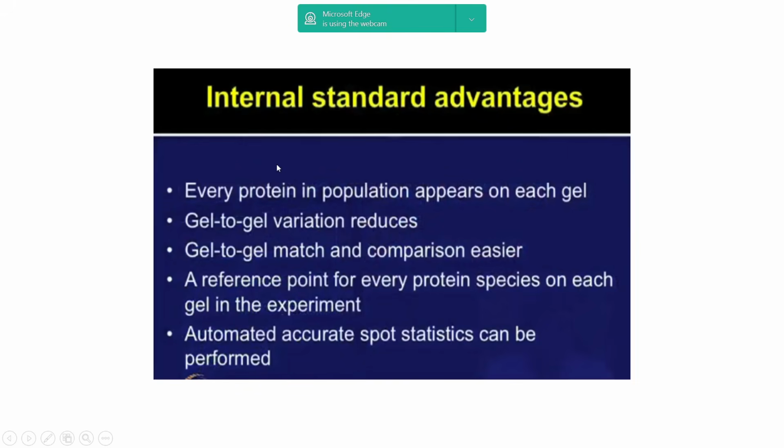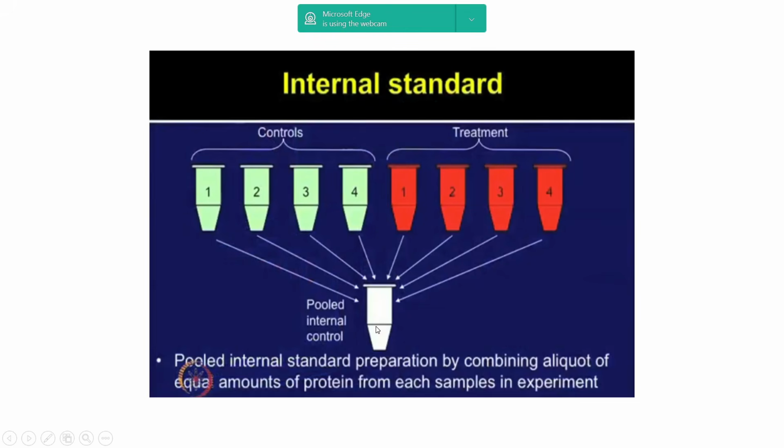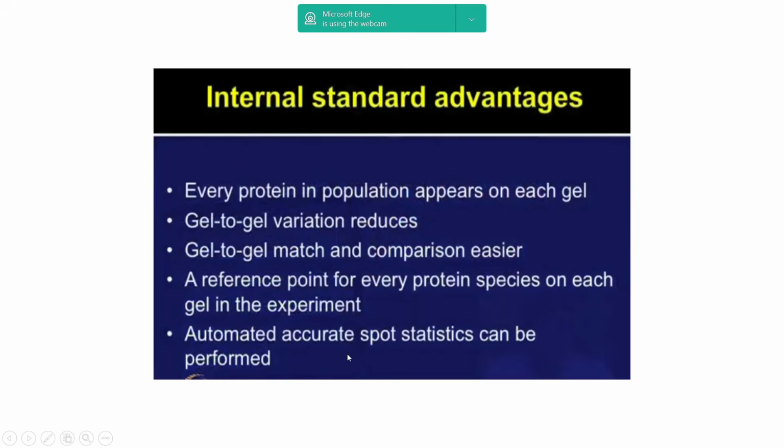So that's the reason an internal standard is required, and there are certain advantages of it. It reduces gel to gel variation. It helps in matching, as I was saying, and comparison becomes easier. It acts as a reference point as well, and while doing the analysis in the software, once you give the internal standard gel after visualizing the gel, you can automate accurate spot statistics with the help of that internal standard gel. That's how it would help.